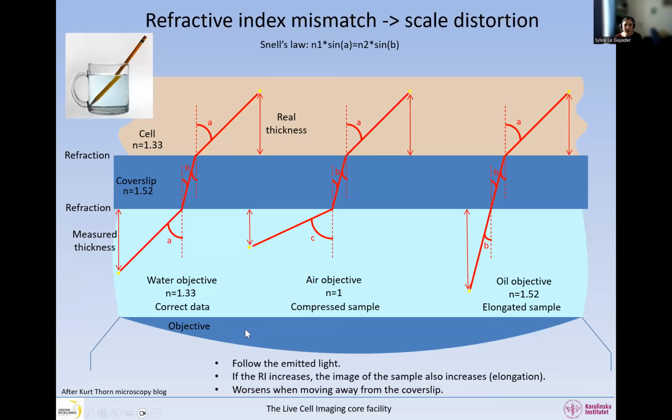And I know that there are some cases when it's difficult, because if you do antigen retrieval, your sample might detach, but then you put it horizontal and there's a lot less risk that it detaches. We will see all this in the sample preparation workshop.